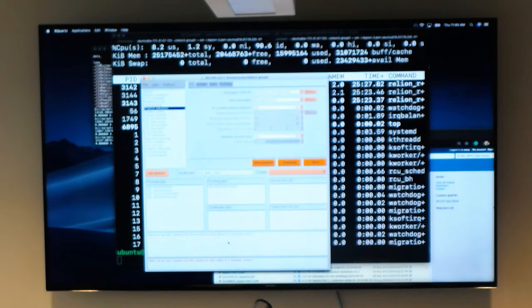Again, the idea is that you have an environment, you have a data set, and you can just start running jobs. And you can start running jobs out of order when I go over the review by hopping into Appion to group 0, where things have already been pre-run, and then you can start seeing other features by making use of already generated outputs.